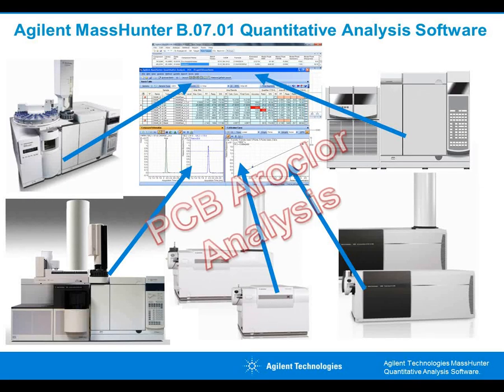Welcome to a discussion of PCB Aroclor Analysis.